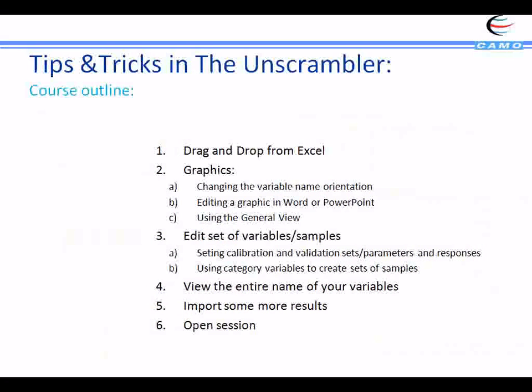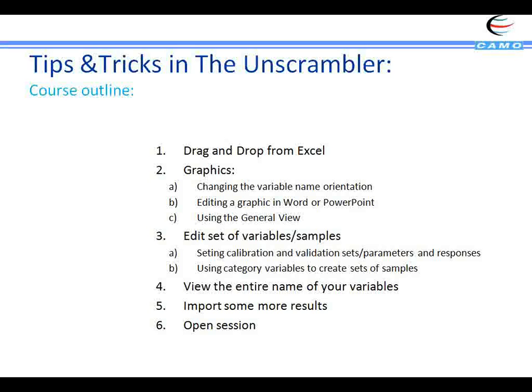Let's look at the agenda for today. First, we'll see how to drag and drop data from Excel. Then we'll look at different settings mainly for graphics, so as to get graphics you can properly edit in Word or PowerPoint. We'll also look at how to view the full names of variables in the editor, use tips to make calibration and validation sets easily, and import results like B coefficients for PLS regression or jackknifing parameters — information stored in the model but not immediately accessible.